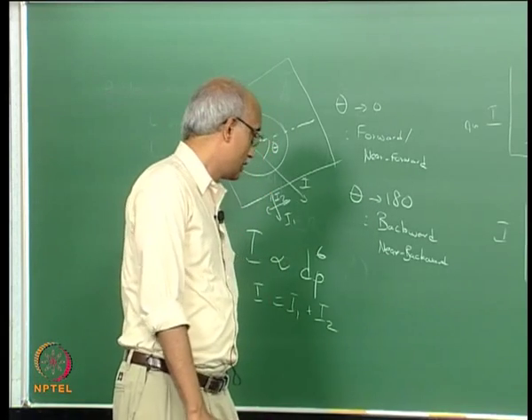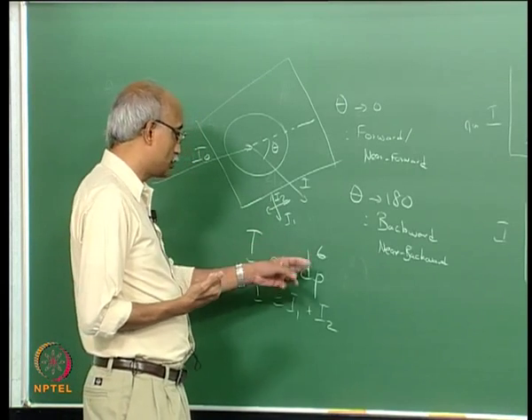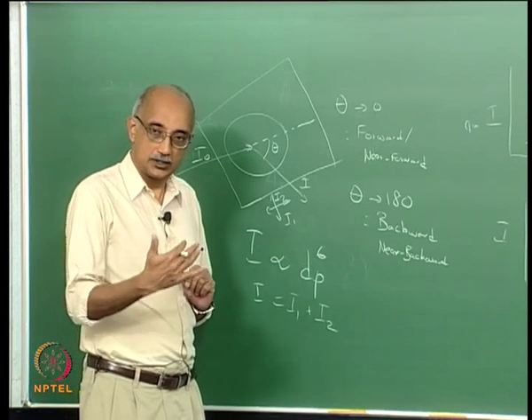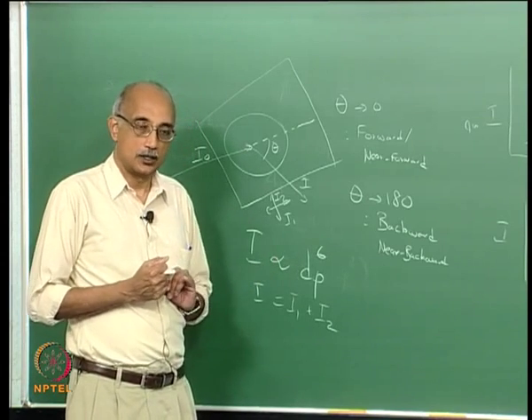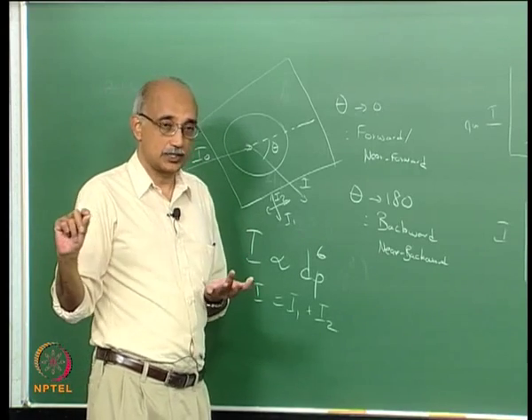So when you look at light scattering from a spherical particle, there are obviously two parameters that affect the scattering intensity. One is the size. Of course, shape is incidental to this. We are assuming again that the shape is spherical. You can imagine that for the same surface area, if you have a highly elongated particle, its scattering tendencies will be completely different.